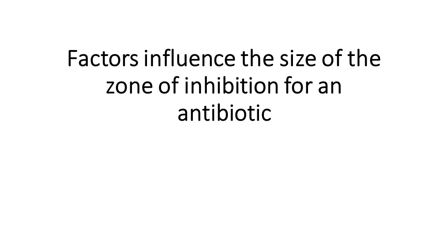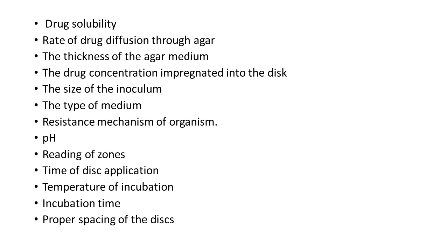Factors influence the size of the zone of inhibition for an antibiotic disc. There are so many factors that influence the size of the zone of inhibition.